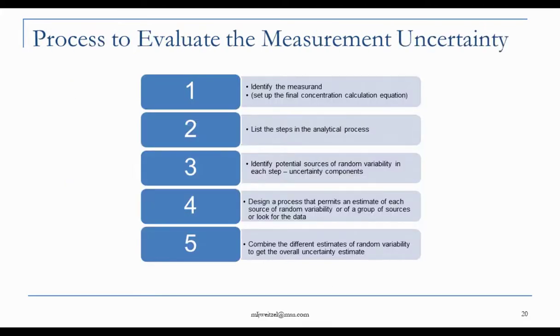There's a lot of documents on how to evaluate the measurement uncertainty, and this webinar is not about that. But briefly, we'll go through the process. So there's a number of steps for evaluating uncertainty.